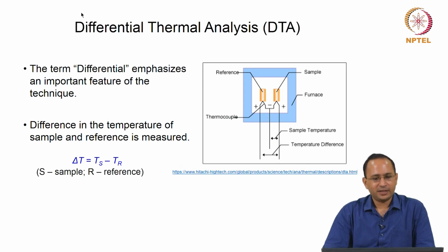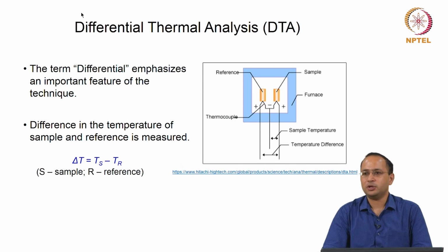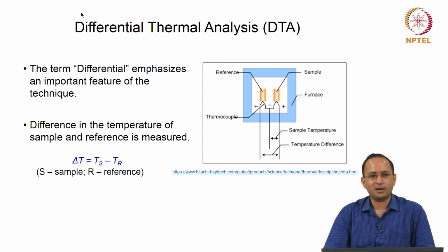So starting with differential thermal analysis, right. First you need to look at the name, differential thermal analysis. The term differential emphasizes an important feature of the technique, okay. Basically what we are doing is measuring the temperature difference between sample and reference. You have a reference along with your sample, and as you are heating your sample and reference together, you measure the difference, the temperature difference, that is the key.